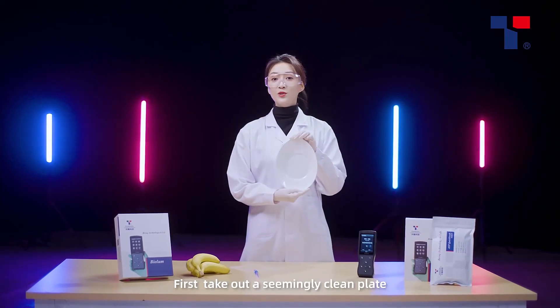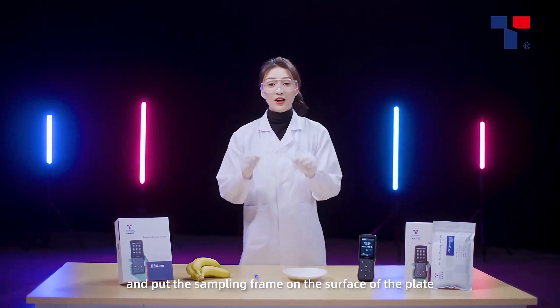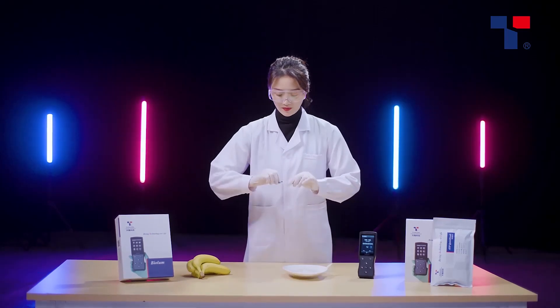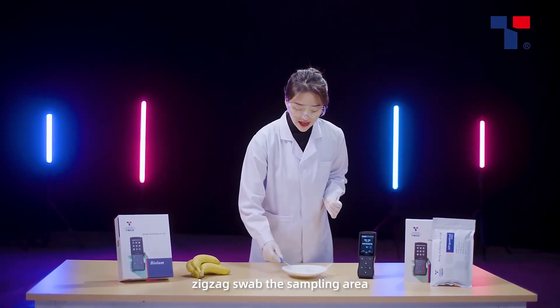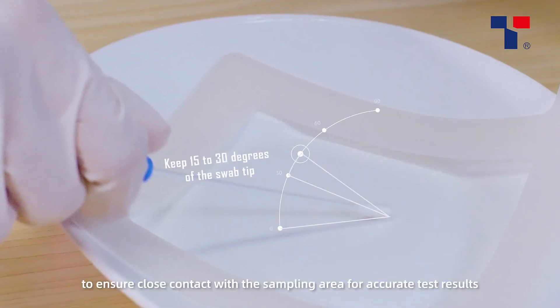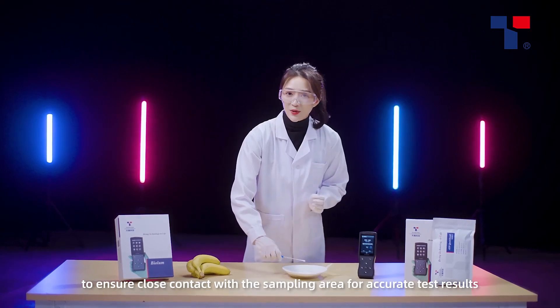First, take out a seemingly clean plate and put the sampling frame on the surface of the plate. Then, take out the swab. Zig-zag swab the sampling area and rotate the swab tip while swabbing to ensure close contact with the sampling area for accurate test results.